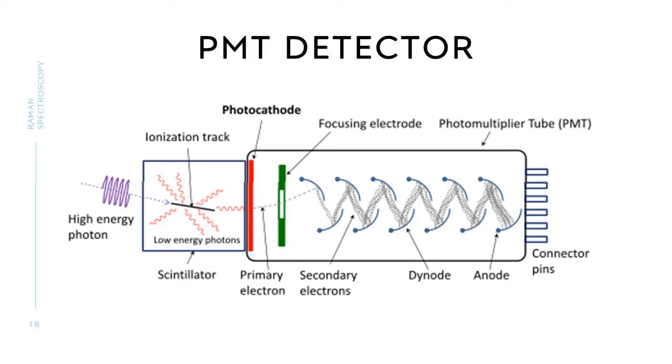So now talking about the working principle of the photomultiplier tube. Photomultipliers are typically constructed with an evacuated glass housing, basically a tight and durable glass to metal seal, like other vacuum tubes, containing a photocathode, several dynodes, and at last an anode. So, an incident photon strikes the photocathode material, which is usually a thin vapor deposited conducting layer on the inside of the entry window of the device. Electrons are ejected from the surface as a consequence of the photoelectric effect.